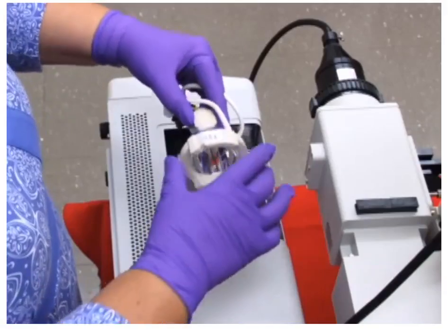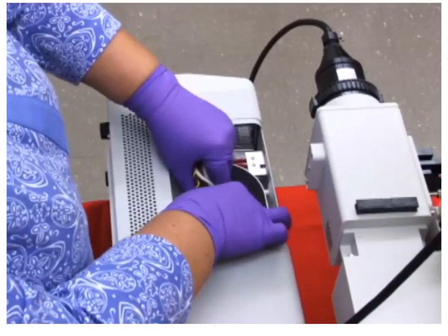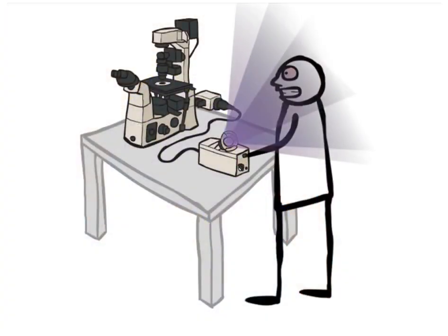This high-powered light source is the most dangerous part of the fluorescence microscope setup, as looking directly into unfiltered light can seriously damage your retinas, and mishandling of the bulbs can cause them to explode.